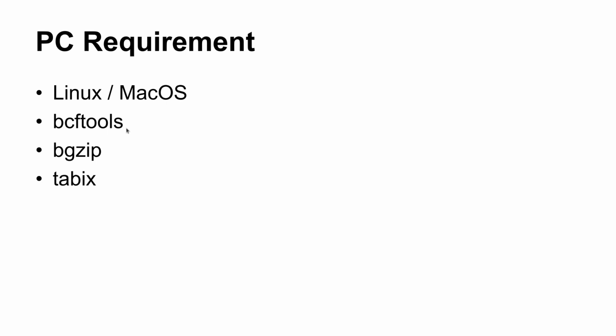We will also use bgzip to compress one of the input files, and then we are going to use tabix to index that input file that we compressed using bgzip. Don't worry, just make sure to follow, and I'm going to talk about these tools later on.